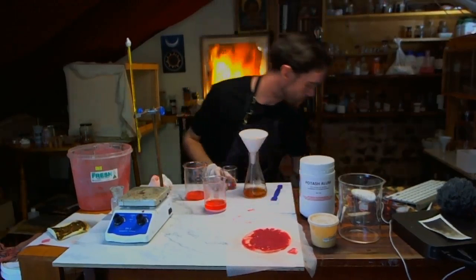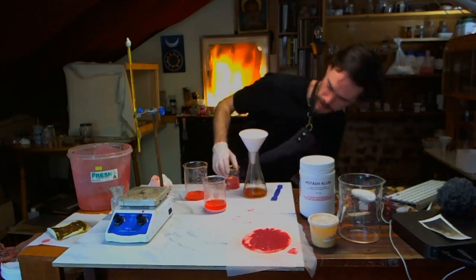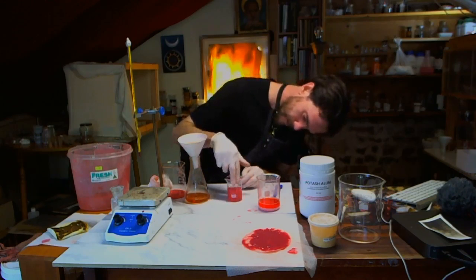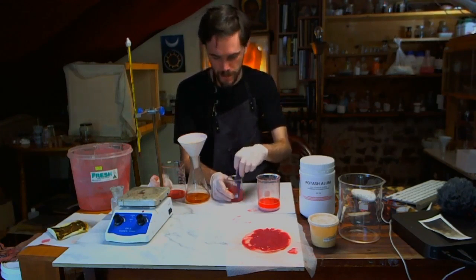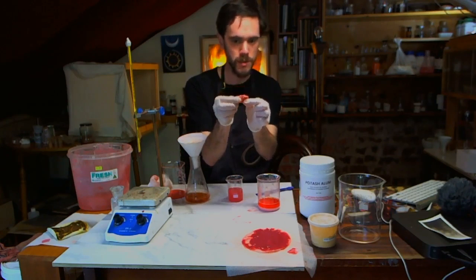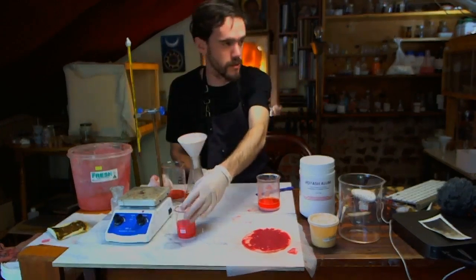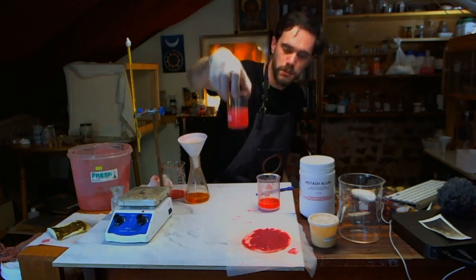Let's just take this now and put it into this beaker and add some water. See if we can soak it out. Yeah, see, the cotton wool is mostly empty now, but we've definitely deposited something in there. So we might have recovered a little bit of it. But it's interesting, look how clean that is in terms of its color.